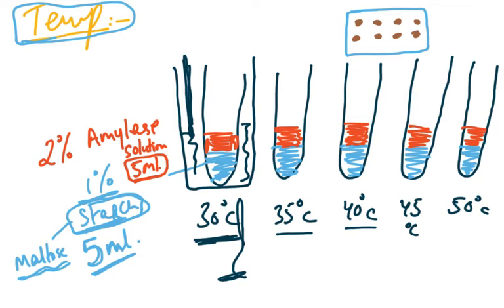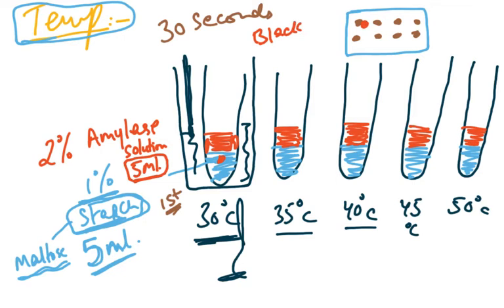After mixing the amylase and starch, we take a drop every 30 seconds and mix it with the iodine on the white tile. If the colour turns black, it means starch is still present. We repeat this every 30 seconds — taking a drop from the amylase-starch mixture and mixing it with iodine — and if it gives a black colour, starch is still present.